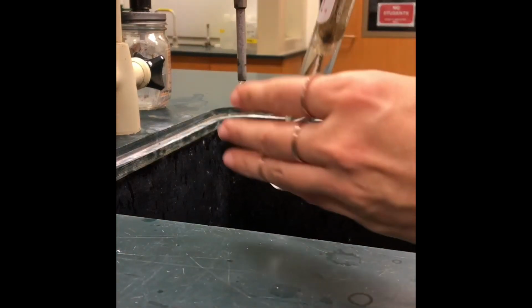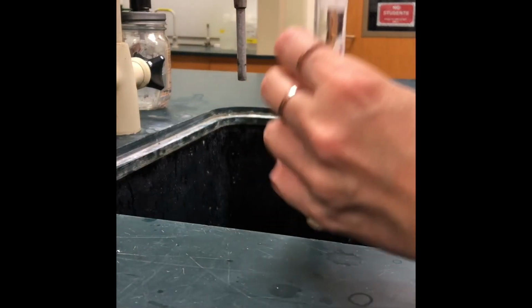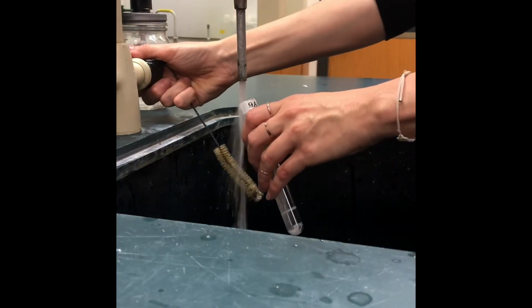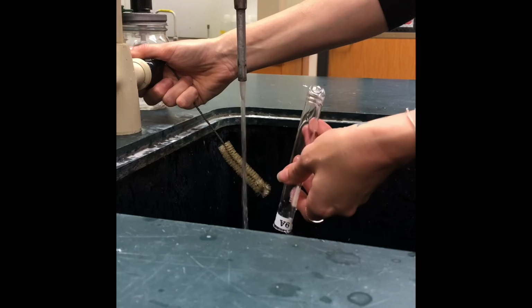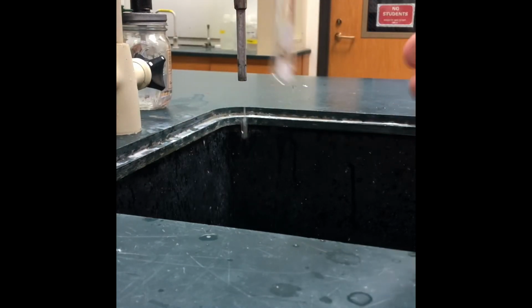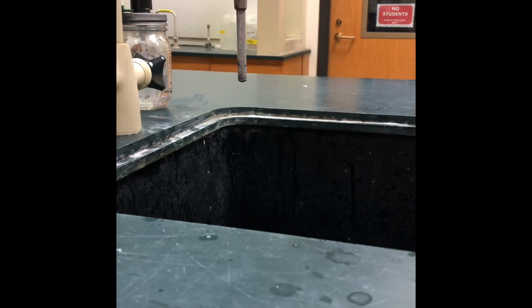So as you can see, I have some water and some soap in here and my scrub brush, and I'm just going to scrub my test tube, right? Clean it, rinse it out. And it's totally okay to take your wet test tube, just kind of shake off the water and put it back in your drawer. It's not gonna hurt anybody, but just make sure it's clean when you do that.